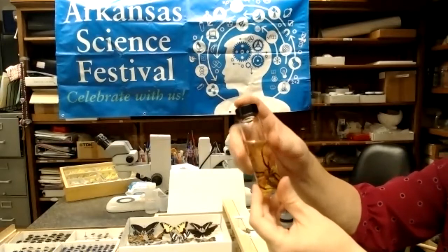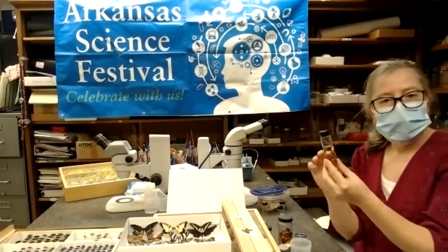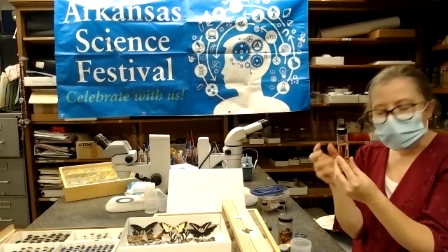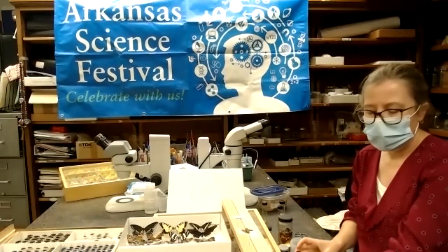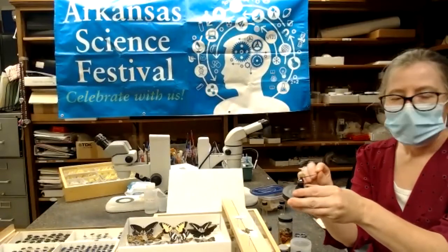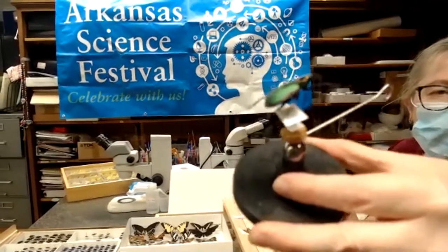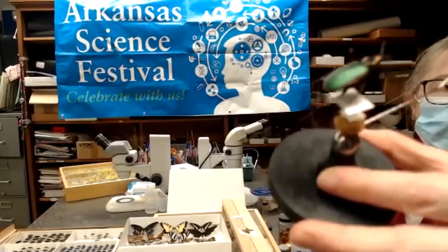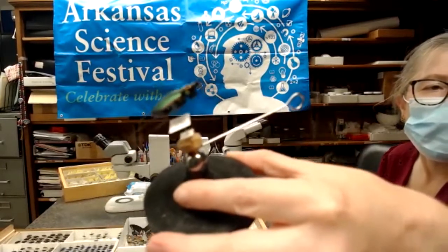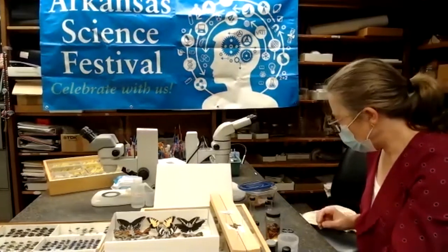and preserved in alcohol. You do not pin these because what will happen over time is that the spider, if you do pin it, will just shrivel up on the pin. And it won't look like a beautiful beetle that we see here that is perfectly pinned. So depending upon what type of insect or arthropod you are collecting, you have to have a different technique for each, unfortunately, in pinning.